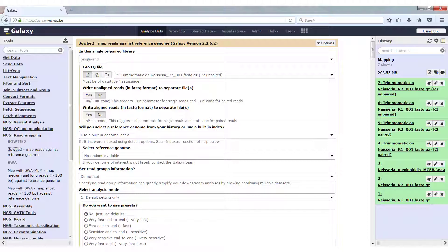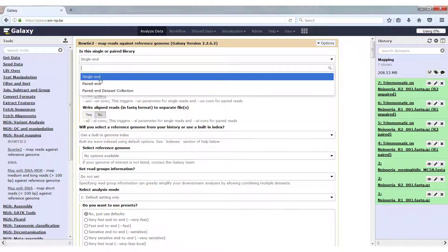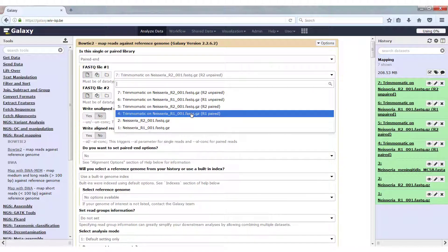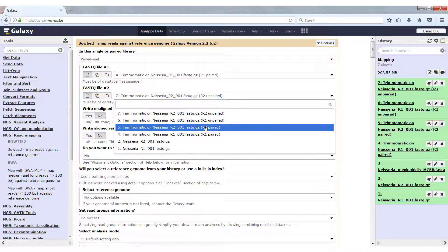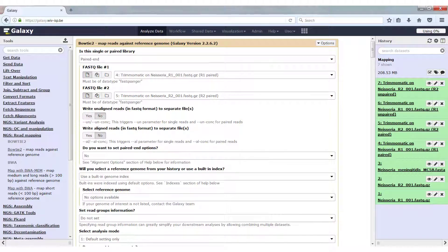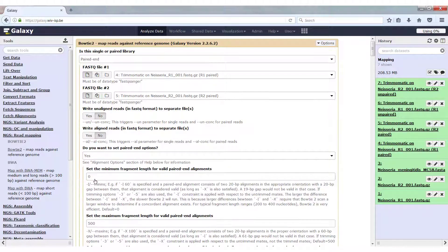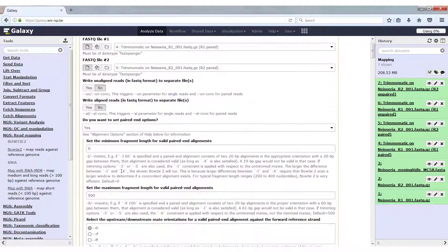As input for Bowtie2, we have to select a paired-end dataset, and I select the R1 paired and the R2 paired reads. If we want to set the insert size, we have to do this where they ask us whether we want to set paired-end options. If you select yes, you can set the minimum and the maximum fragment length to be able to tell whether or not a read pair mapped correctly.